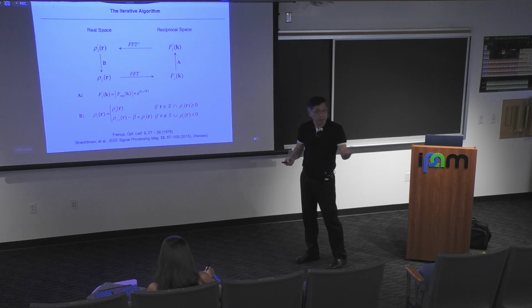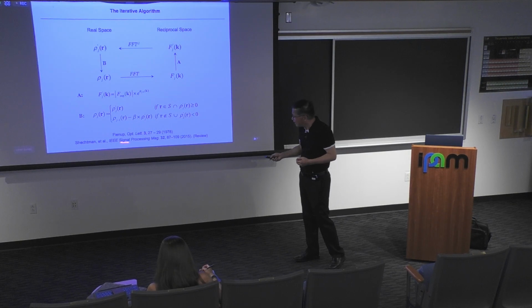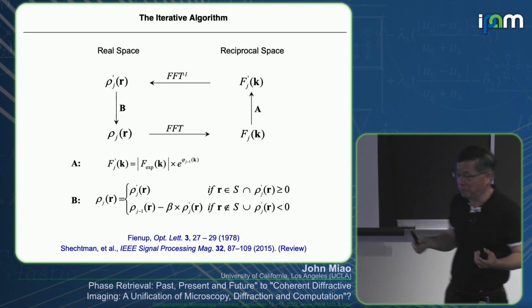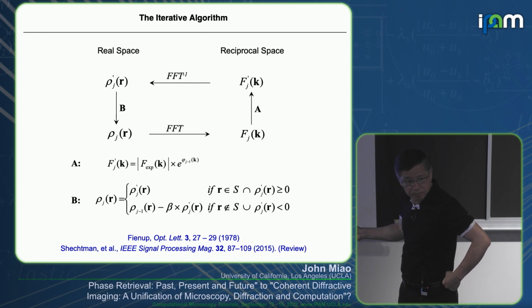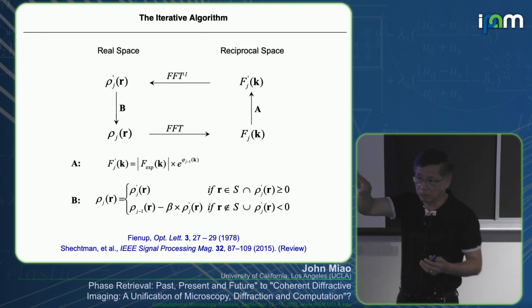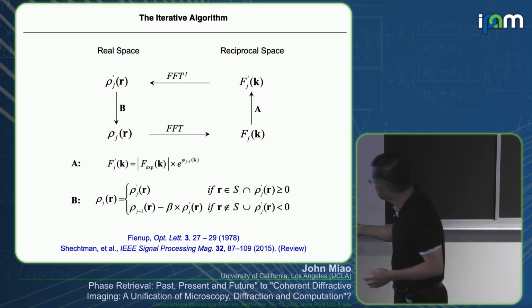That's correct because it can be verified numerically. I'm going to show it can also be verified experimentally. I read many of the papers. If you look at all the different shapes of plates, it turns out the shape doesn't matter much. So the algorithm started with that. Okay, this is the measured experiment. You can compute it on the computer. You can generate a random phase. So you have a 2D array, and each pixel can have a random phase from 0 to 2 pi. Okay, so you get this.